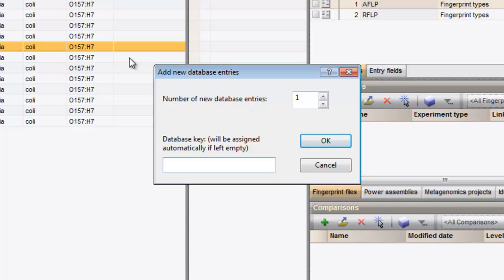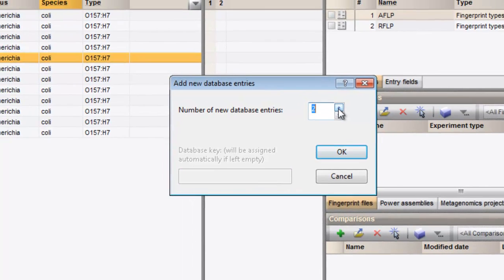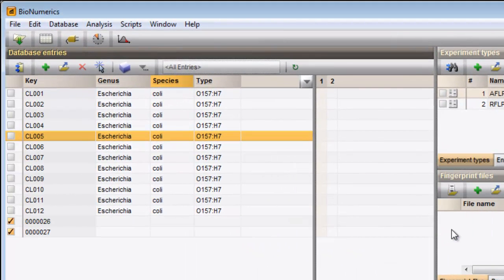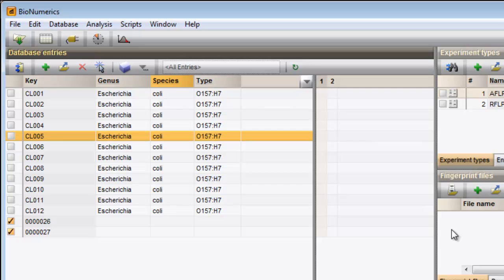As an example, I will create two new entries in my database. The entries are added to the Database Entries panel. Bionumerics has automatically assigned a unique key to each new entry.